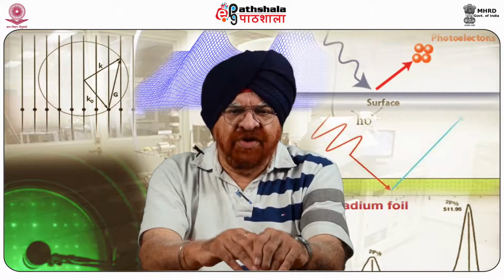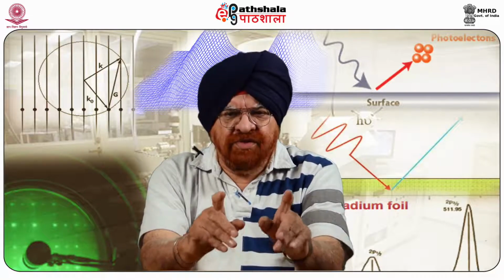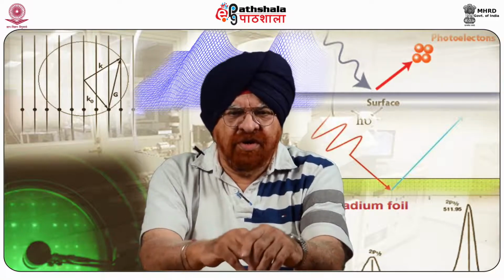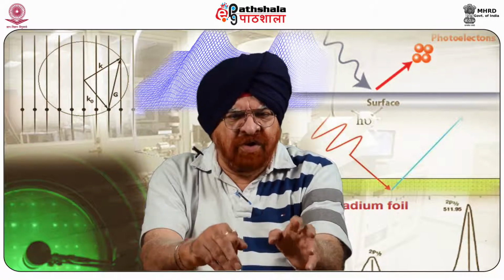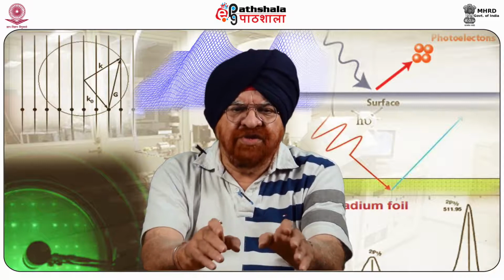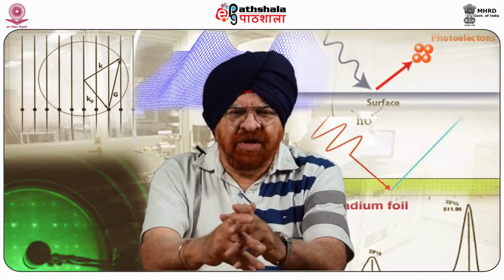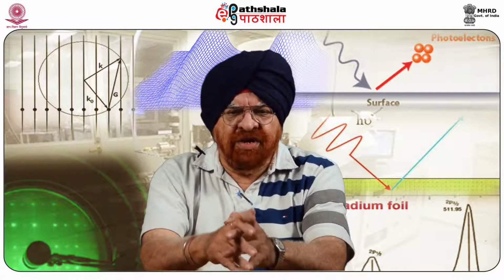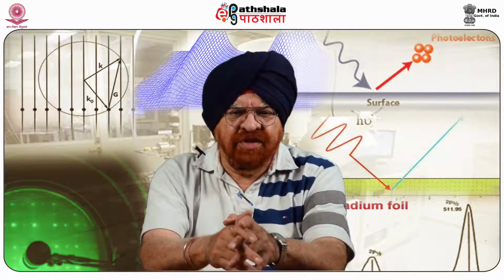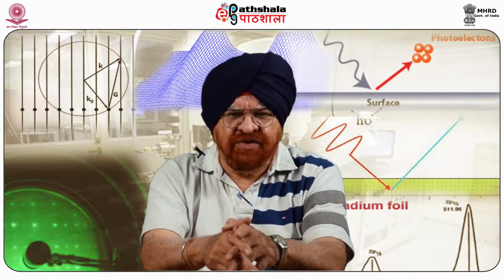Since its first introduction by Nonnenmacher et al. in 1991, not very long ago, KPFM has been used extensively as a unique method to characterize the nanoscale electrical properties of metal and semiconductor surfaces and semiconductor devices.